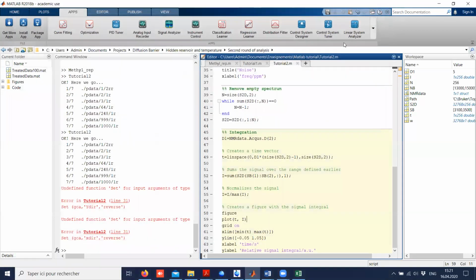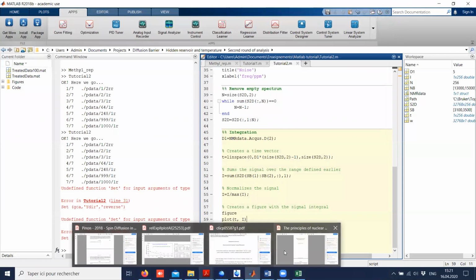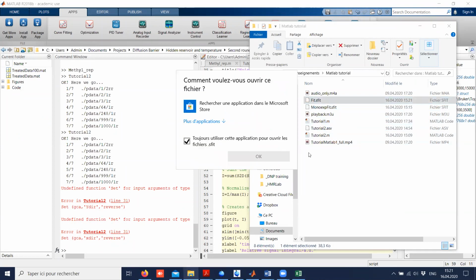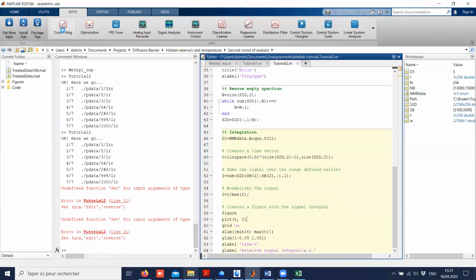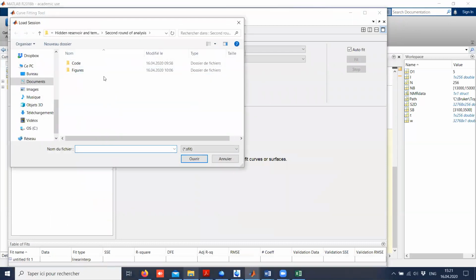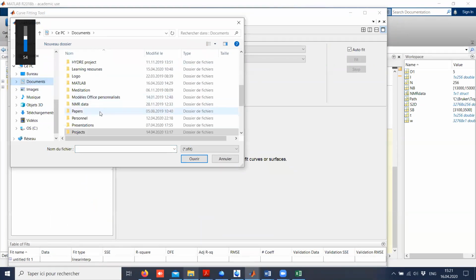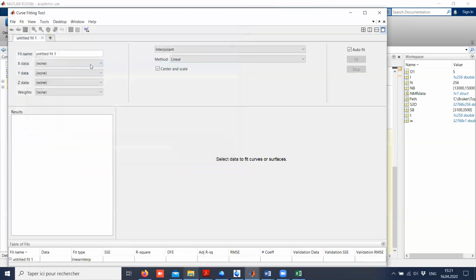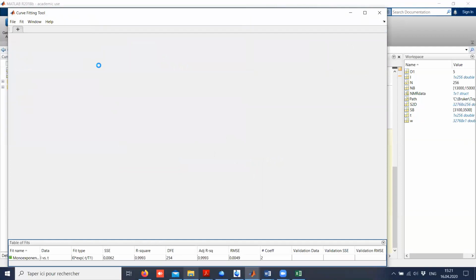For example, if you do the bi-exponential fit again. Oh, sorry, I closed it too fast. Or if you have some sort of function where you need to constrain parameters like a and b. Instead of having a bi-exponential fit where you have a and 1 minus a as the coefficient, you could have a and b, but you can constrain the sum of a and b to equal 1, for example. Is that sort of thing possible?